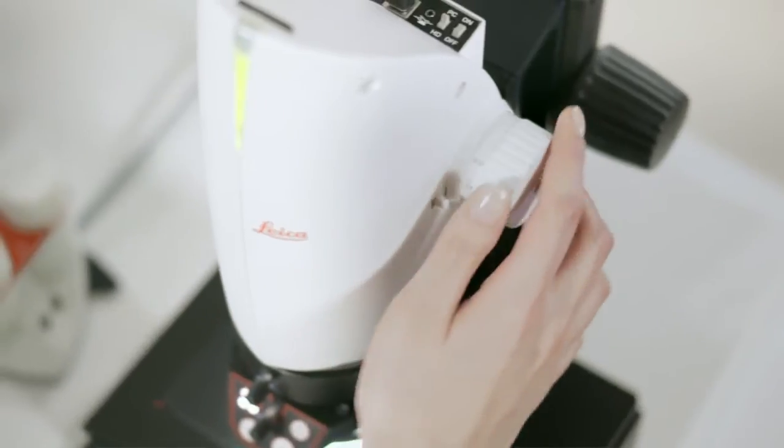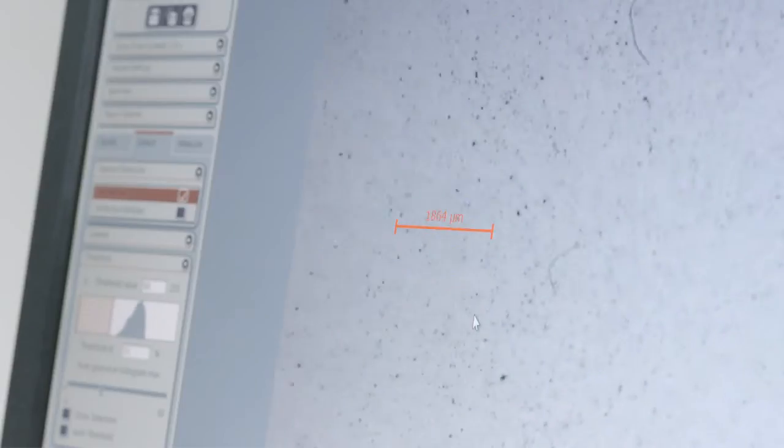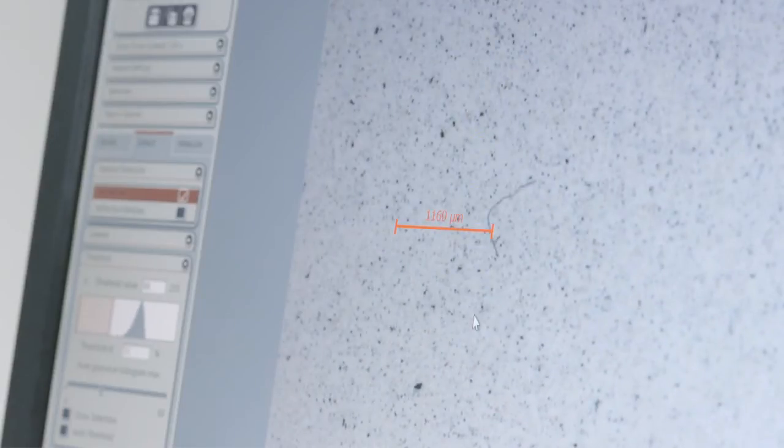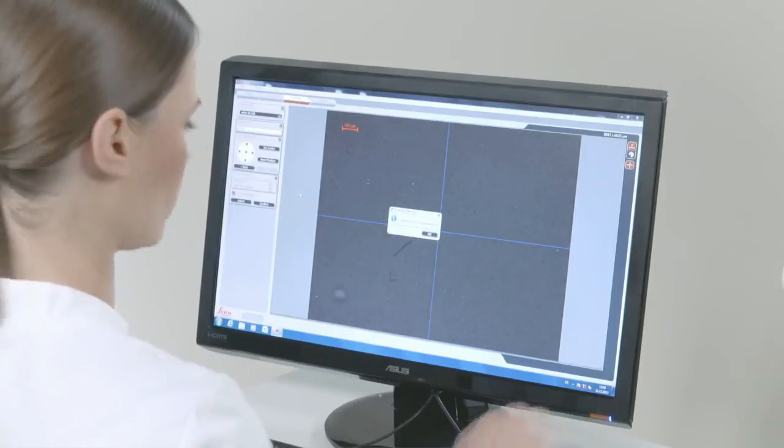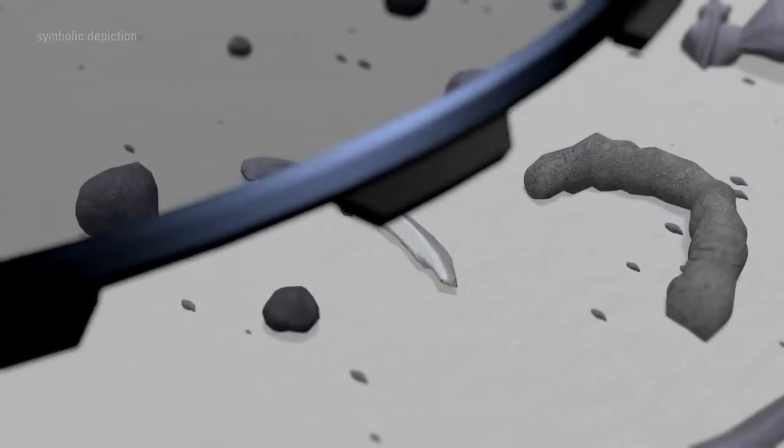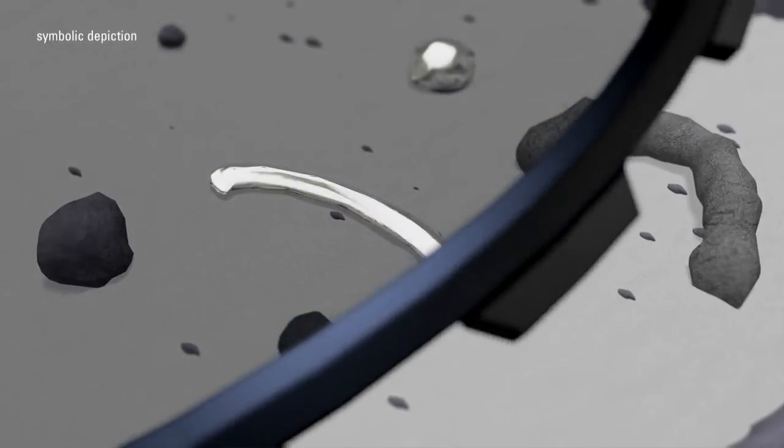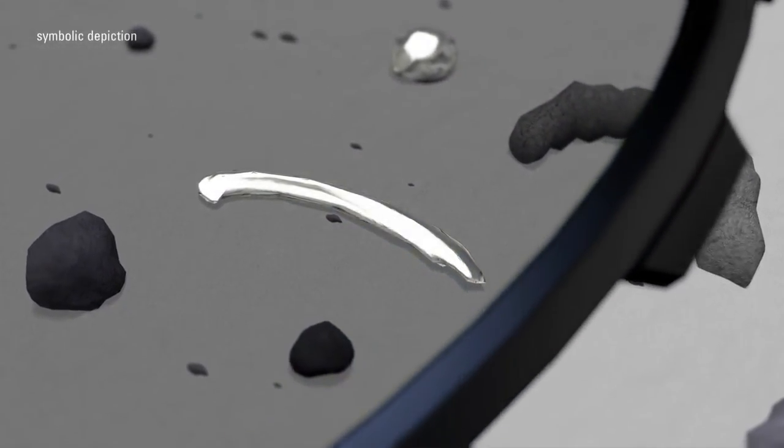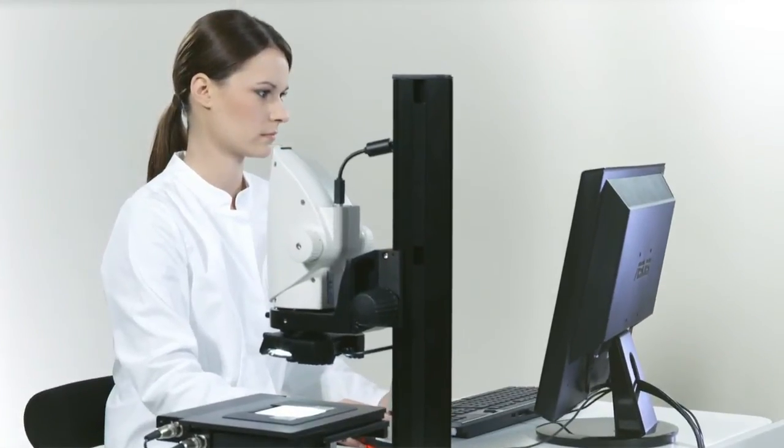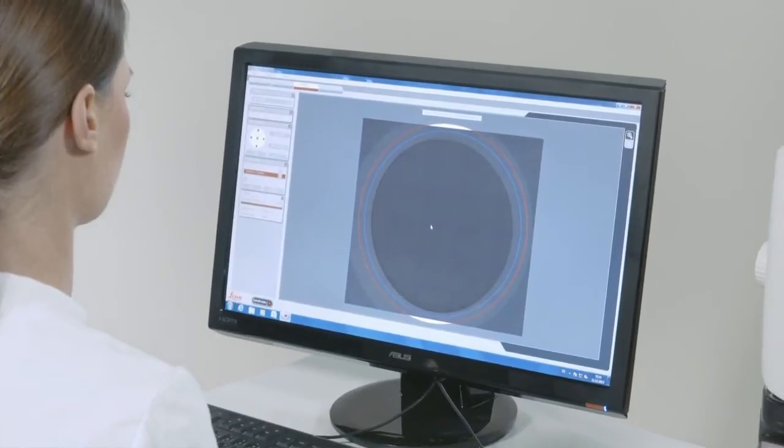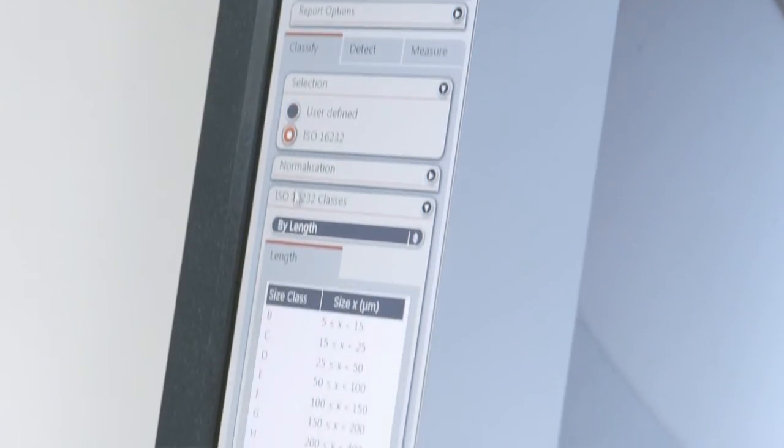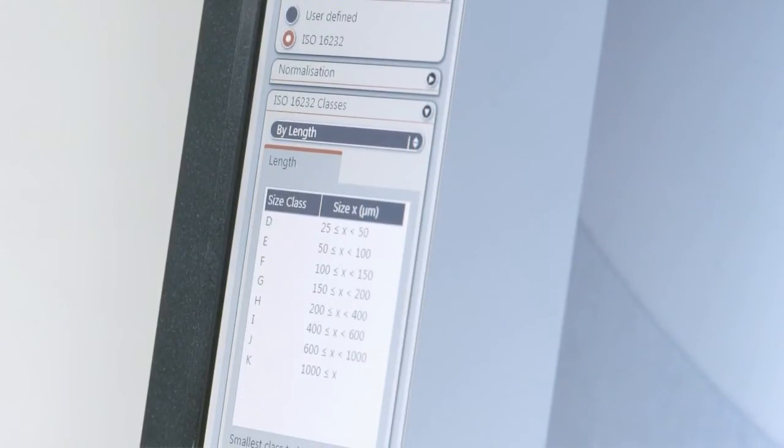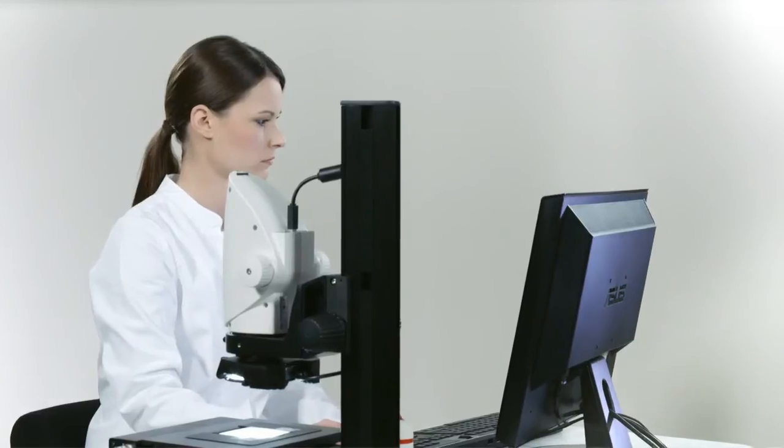The Leica DMS 1000 features an encoded zoom for exact reproducibility of measurements, and it can distinguish between reflective and non-reflective particles, a necessity in many cleanliness inspections. Even in such a compact system, there are numerous software options, for instance automatic analysis according to engineering standards or your customer's specifications.